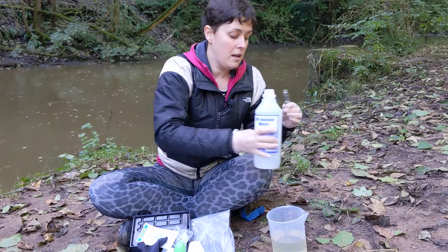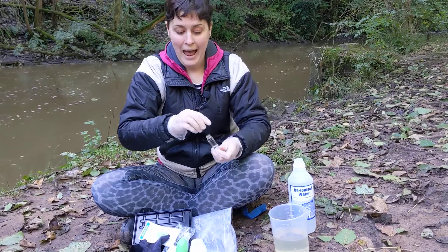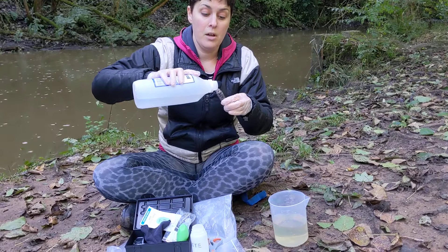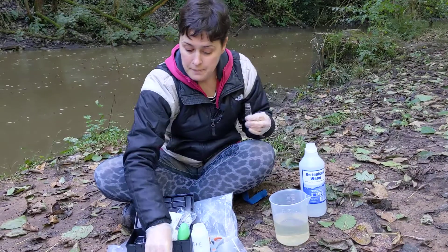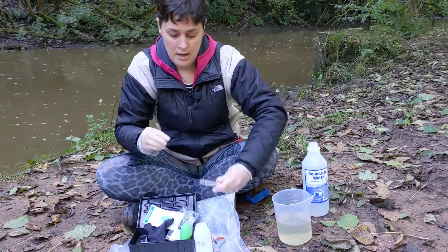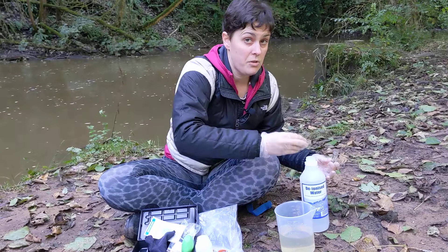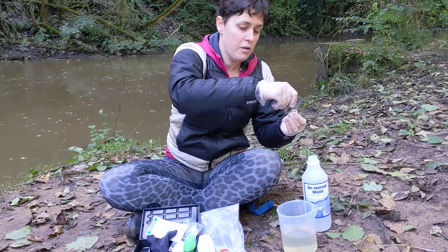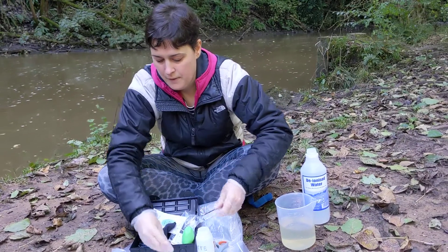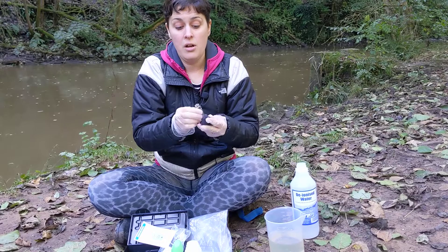Just like at the beginning, pour a little dribble of water into the cuvette, give it a shake, and pour it into your waste bottle because there might be tiny traces of reagent in there. Do that three times. Sometimes if you've got a big bottle you can end up pouring it all over yourself, so make sure you've got a cloth to dry off. Give it a little bit of a wipe down afterwards and leave the cap off so it can dry out.